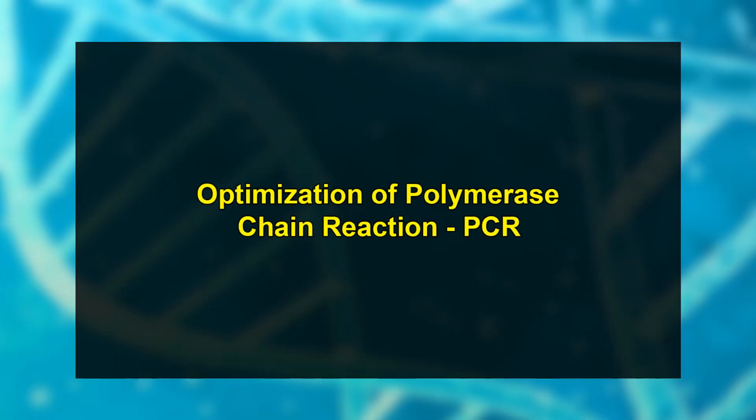Dear students, let's talk about the optimization of PCR. In practice, PCR can fail for various reasons such as sensitivity or contamination.